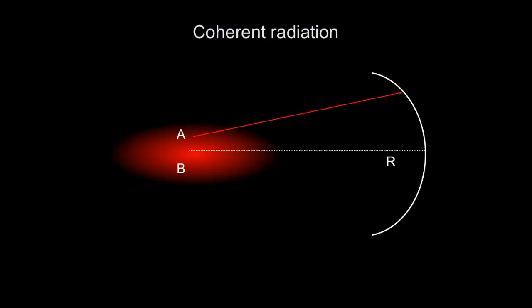And molecule B is also emitting a photon. Okay? These A and B are driven by the same laser field. They have the same phase in this plane. And so the length of this arrow and this arrow determines how much of the signal I am able to collect at this location, because there's coherence between A and B. Okay? That's the whole idea of coherent microscopy.